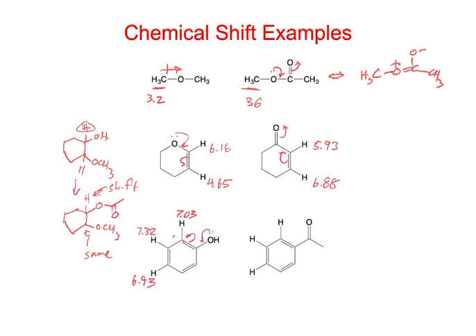Okay, because we end up with a delta minus there and here. If we have a carbonyl, it goes the opposite direction. So we should have a delta plus here and a delta plus here, right? So these are like 7.81 and 7.66. Those are more deshielded, and this is at 7.52. Okay, so they kind of swap positions in these two situations.